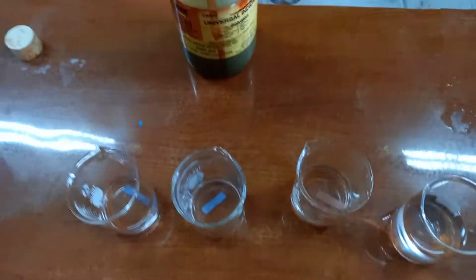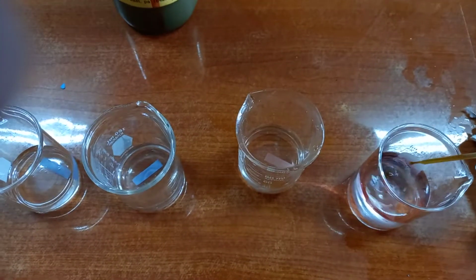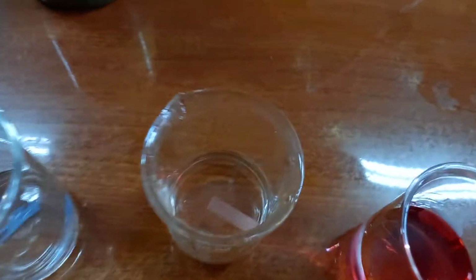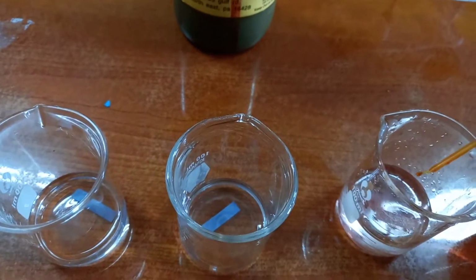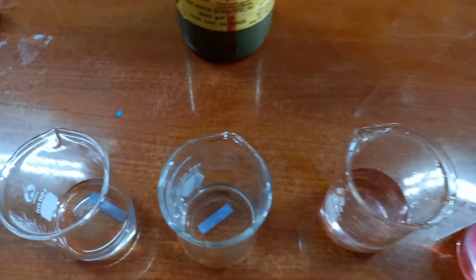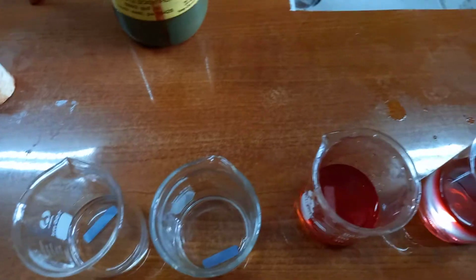Next I'm going to add the universal indicator. So it's red in the acid. Same thing for the aldehyde.